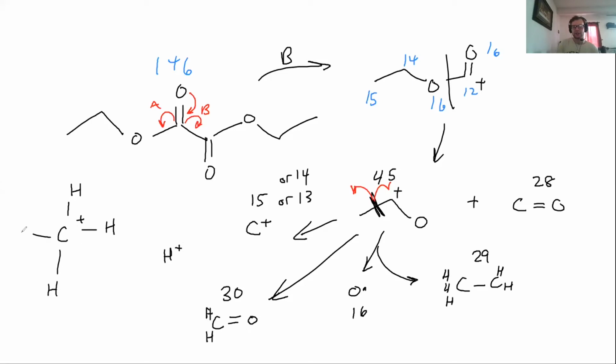So a tertiary carbocation is much more stable. If there's any stray hydrogens running around, or maybe it took it from this guy that left, we do have free rotation. So as that splits, maybe this guy latches onto one of those hydrogens. So that's how we would get the 31. So we do get 30, we also get 31, and we mainly get 29.